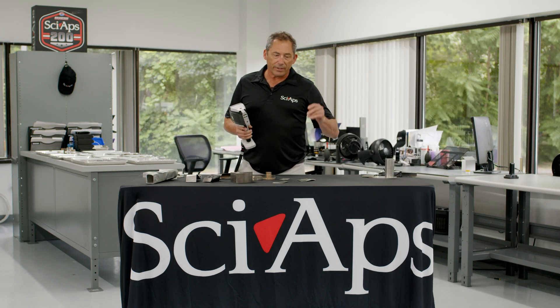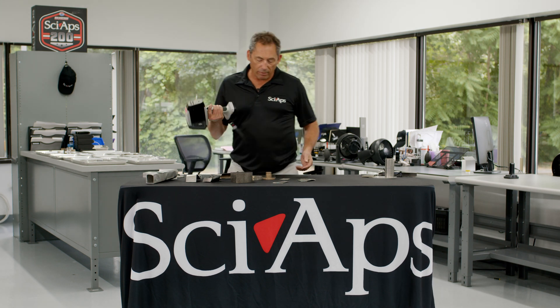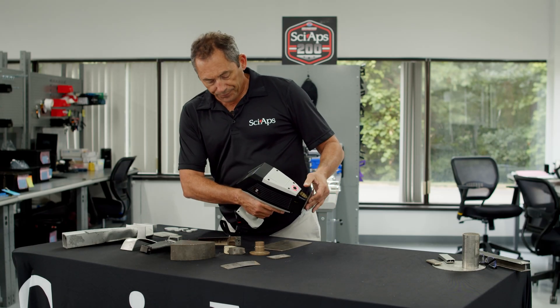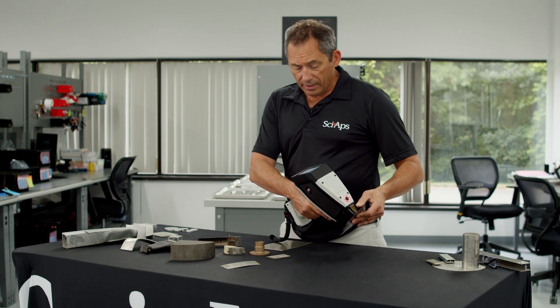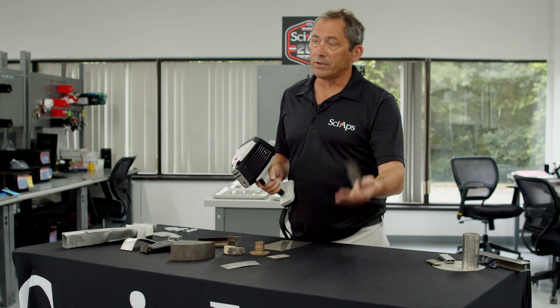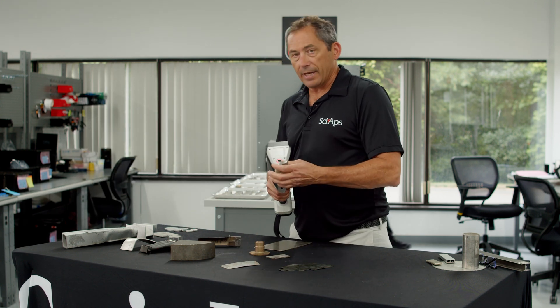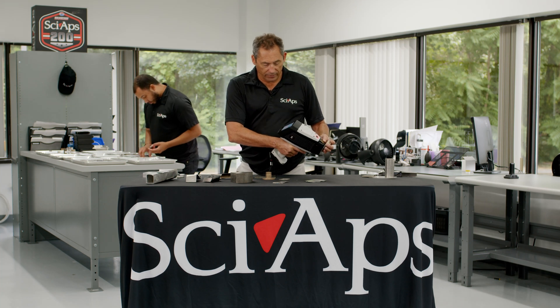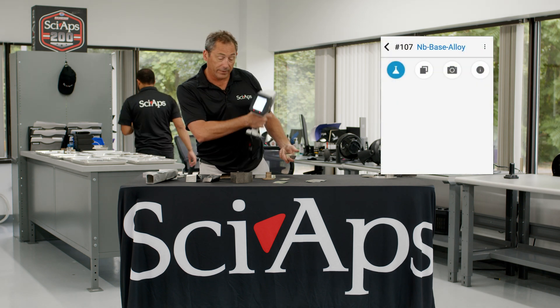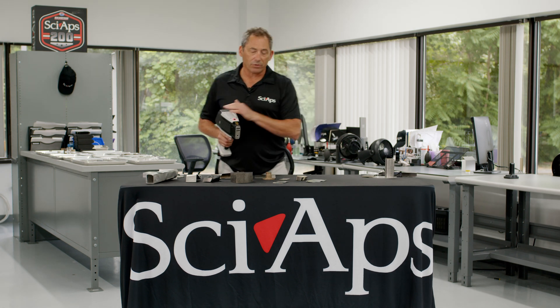The question I also get is: what happens if I test some piece of metal and I have no idea what it is — what if it's not one of the seven base metals programmed into the device? So let's do that. This is a piece of pure moly. If I shoot pure moly, even though I don't have that base in here, it just calls it a moly-based alloy. If you need to start identifying molybdenum alloys, you can add them into the software. It won't give you the wrong answer if you don't have that base there. Another good example: this is a CB-103, and it says it's a columbium or niobium-based alloy. If you need to add it, you can do it. With other analyzers you have to send them back to the factory — with this one you can just add those alloys right in.